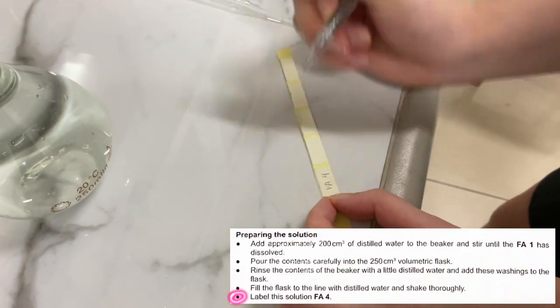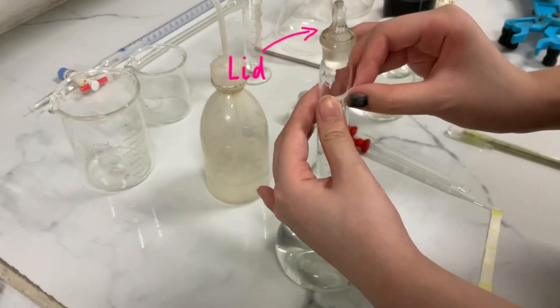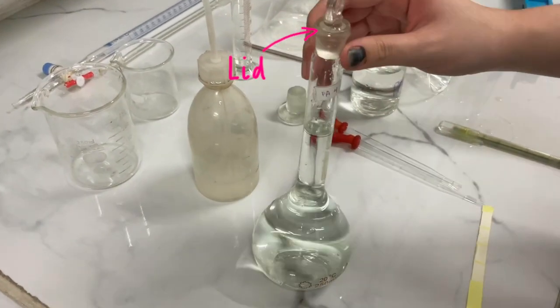Then, label the solution FA4, and don't forget to close the volumetric flask with a lid to prevent it from oxidizing, which can cause an alteration to our results.